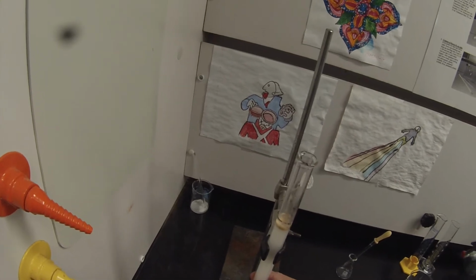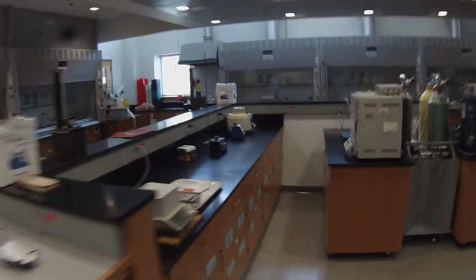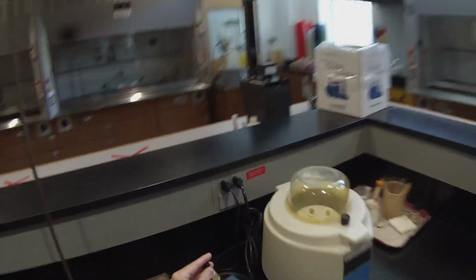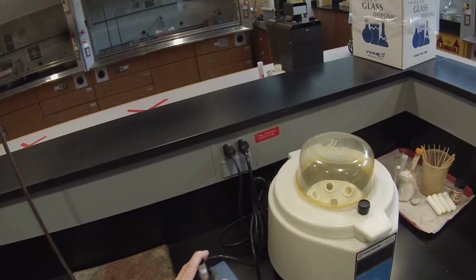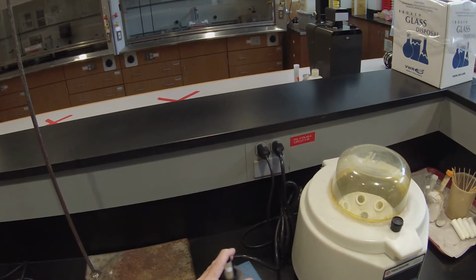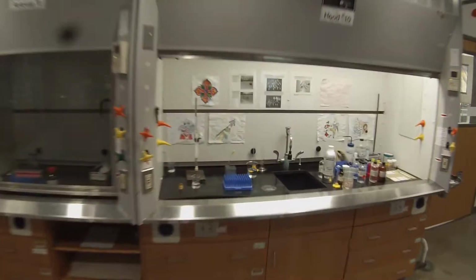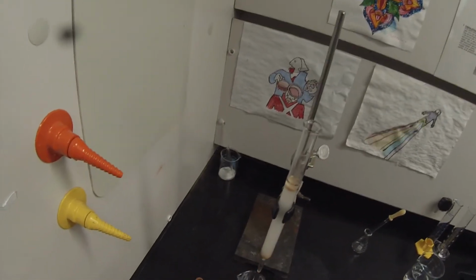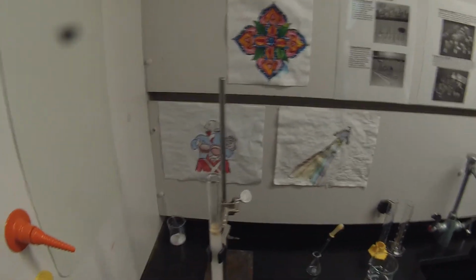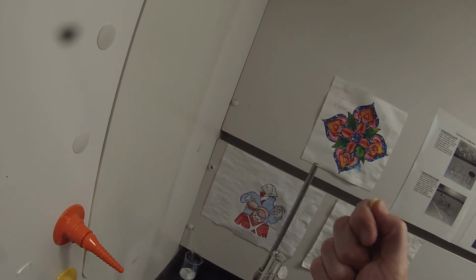I'm going to stick this in the Vortex Genie, really give it a buzz, see if I can get that to dissolve a little better. This is the classic problem with chromatography, is getting your compound of interest to dissolve in something that will allow you to transfer it to the column without being so polar that it will also drag it through the column way faster than you want it to.